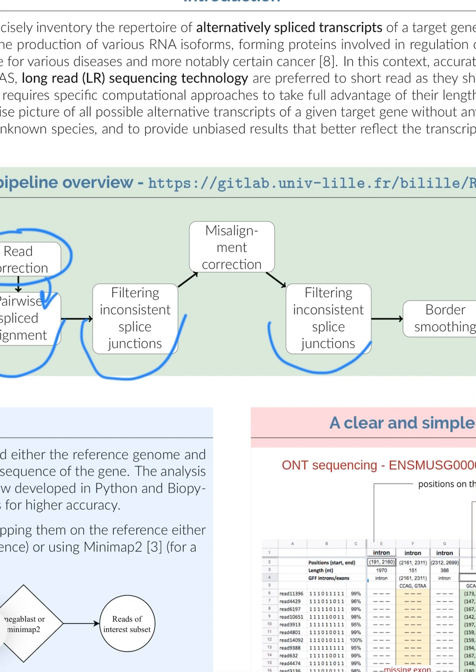First, we identify inconsistency, and after this identification, we perform our misalignment correction method, as inconsistency in the read can result from error in the alignment process. So to try to resolve this inconsistency, we perform local alignment with Exonerate of a subpart of the read. After this realignment correction, if the splice structure of the read is still considered inconsistent, then it is discarded from the analysis.